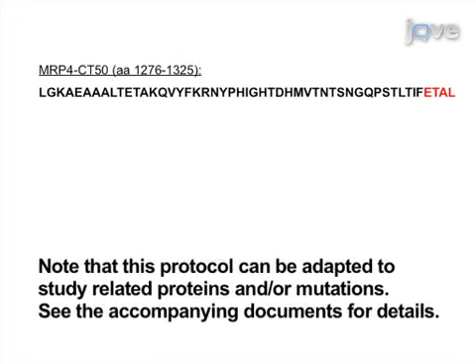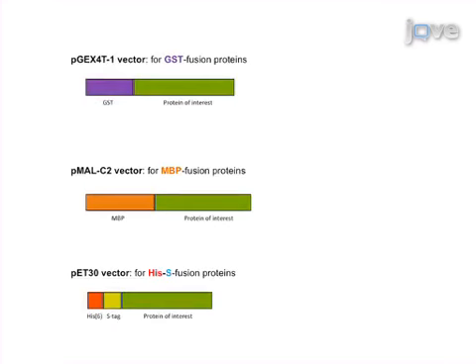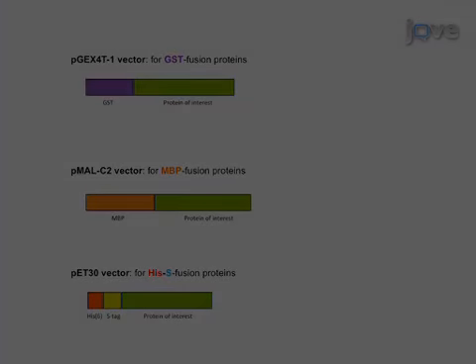Using PCR, amplify the DNA that encodes the last 50 to 100 amino acids containing the PDZ motifs at the C-terminus for the cAMP transporter MRP4 and the PDZ1 domain of sodium hydrogen exchanger regulatory factor, or NHERF. Next, clone the MRP4 PCR products into pGEX.